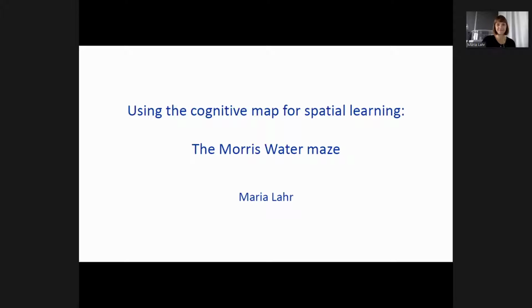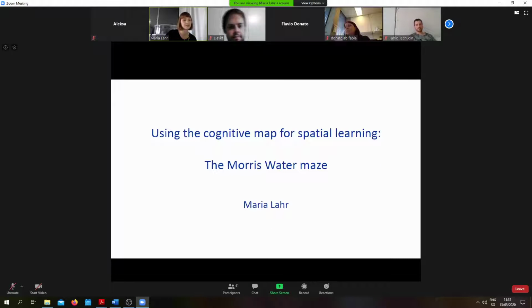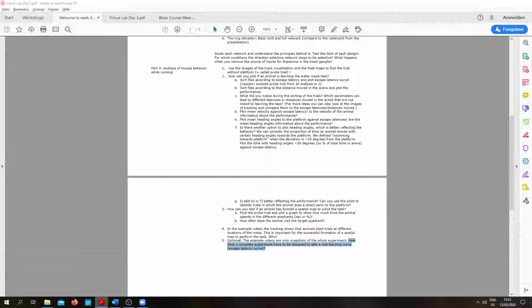So then welcome everybody to the next practical session. It will be your first behavior experiment. And I will show you a very classic spatial learning paradigm, which is the Morris Water Maze, named after Richard Morris, who designed the task in 1979, if I remember correctly. And I will tell you a bit about it.